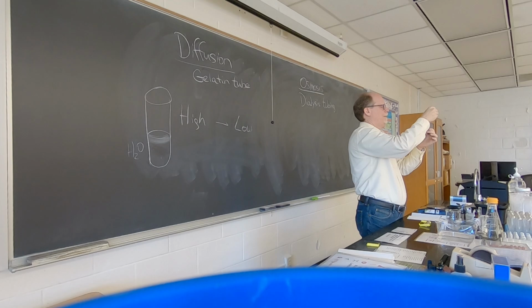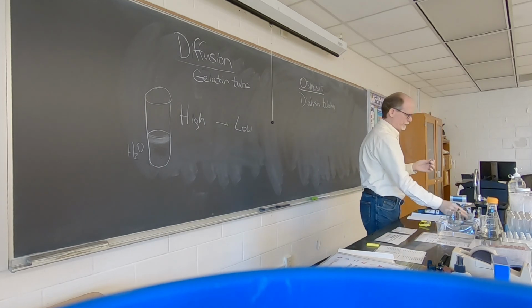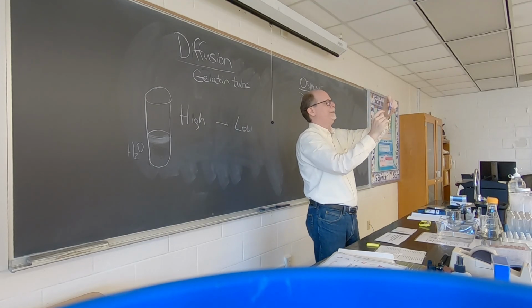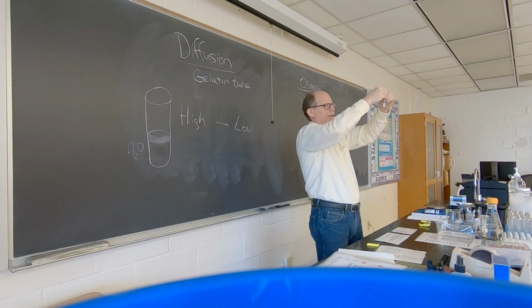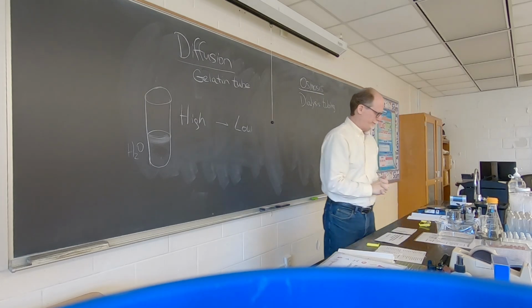So if I take off the dye, it doesn't look like there's so much in there now. But it's moved a little bit down compared to this one. It's still at the top of the gel, but it's kind of hard to tell.